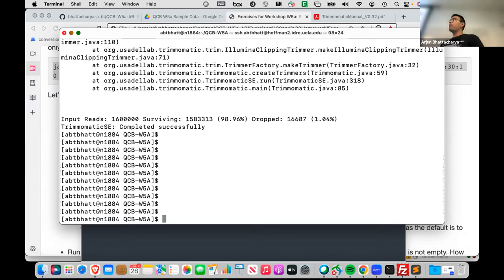At least for us, the first processing step we're doing on these files is trimming. So if I had say 500 FASTQ files, I would save these trimmed files separately in an intermediate folder. Then for the next step, it's another folder, and the last step is in a final folder. So like KD1_trimmed.fastq.gz. It's still linked by the sample name, but you know what's been done to it.